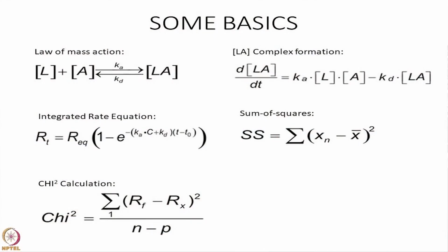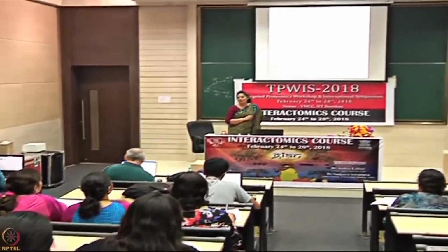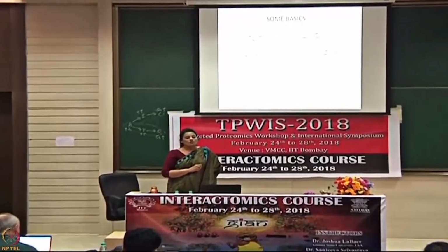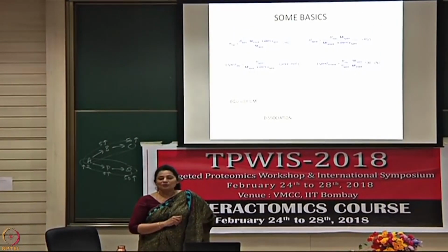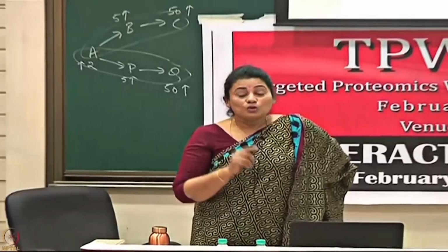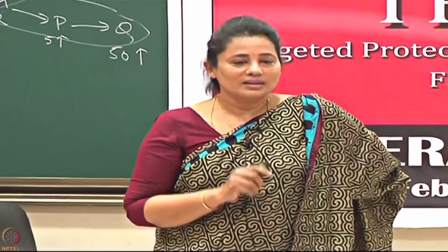before you start an SPR experiment, just keep these things in mind. You calculate, you find the expected values, go back, interpret your sensogram. Don't try to fit the data before understanding the sensogram. You can fit it to any equation that you want, you will get a value, you will get a chi-square. Never ever do that. Most often, it is the simple 1:1 binding that is happening.